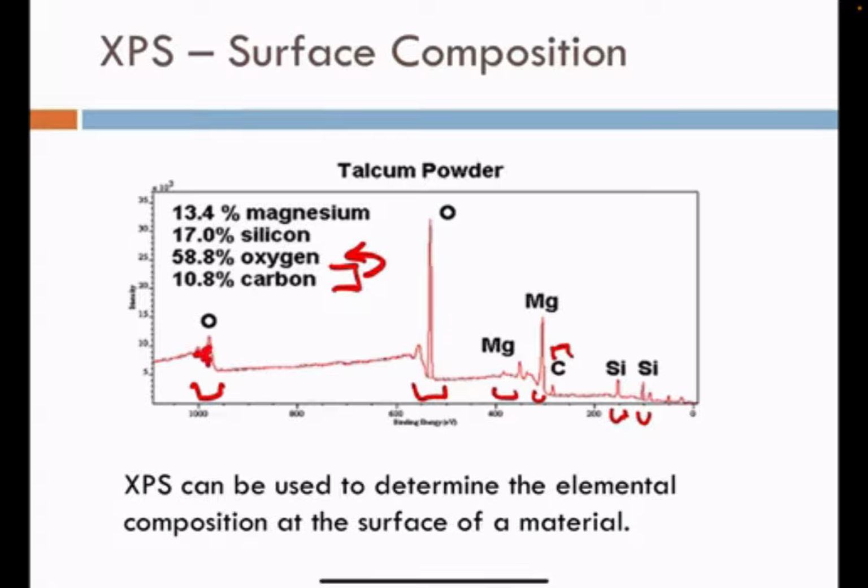We have seen this peak shift in the oxygen to two new binding energies, and we understand the change from the neutral state to a more oxidized state of the surface. With a new material, we can look at the binding energy, and we can look at the corrosion.